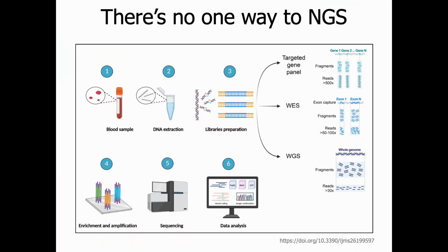There are a lot of ways that NGS library prep workflows are done, depending on the goal. Some workflows require PCR, some don't. Some require extra capture and cleanup steps, some require extra size selection steps, but they pretty much all start at the same place, with extracted DNA or RNA of unknown concentration and quality.